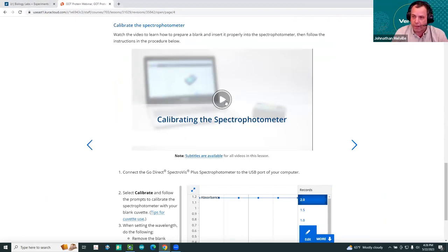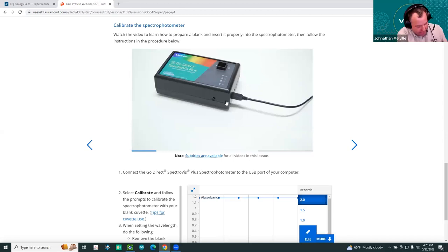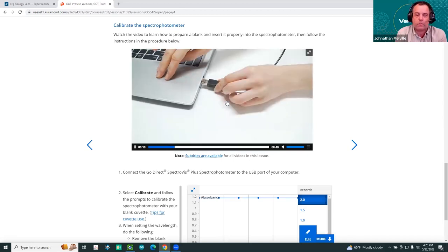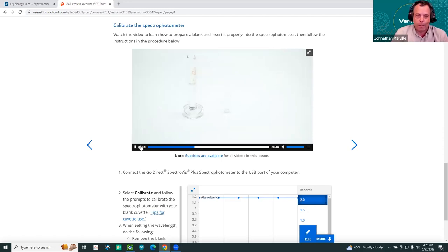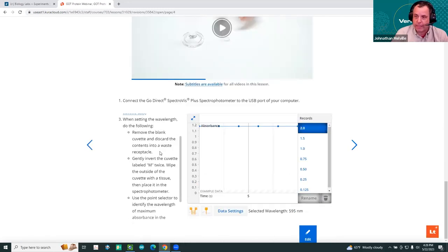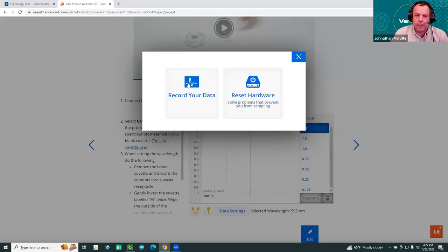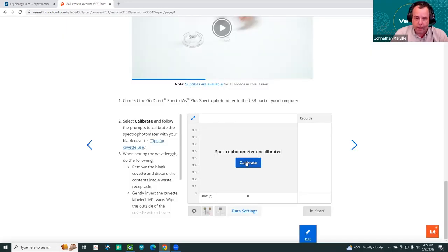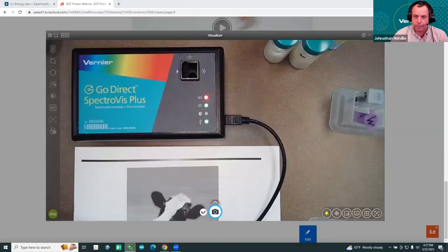Let me go back to LT. The next step is to calibrate the spectrometer. LT has really amazing videos that show you how to connect everything, use it, and calibrate the device. I'm going to plug in my spectrometer now. One key thing about this lab in particular is the blank you use — in this case the blank is unreacted Bradford reagent. In LT you'll see we've defaulted to sample data; I'm going to switch that and actually record live data.